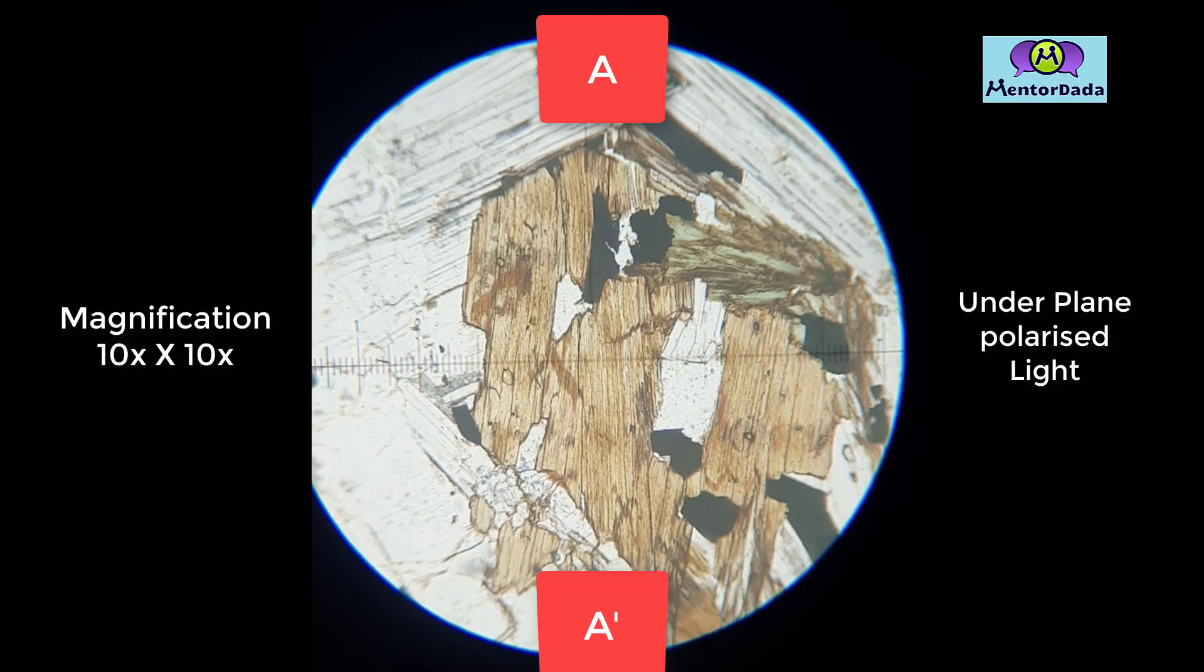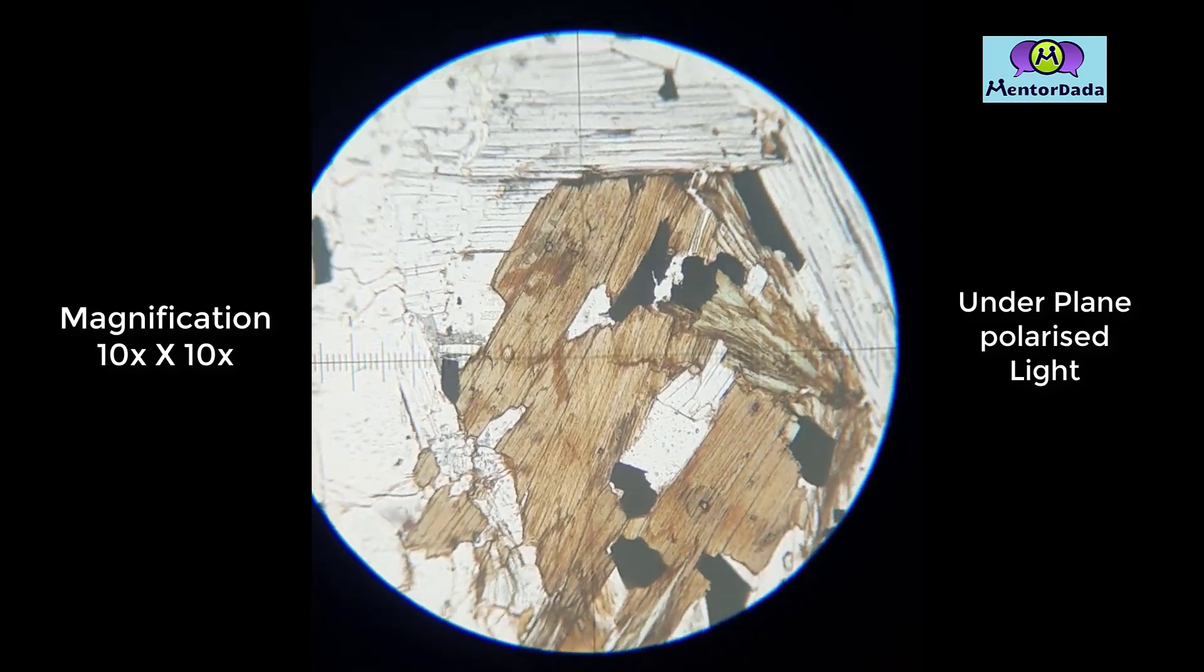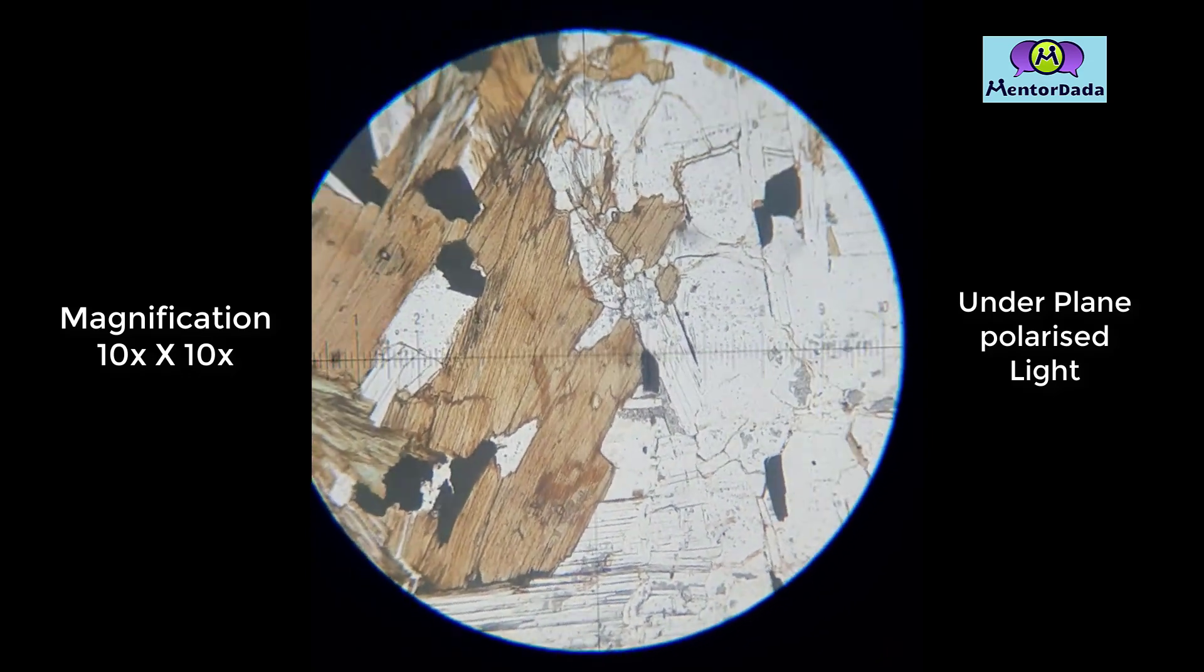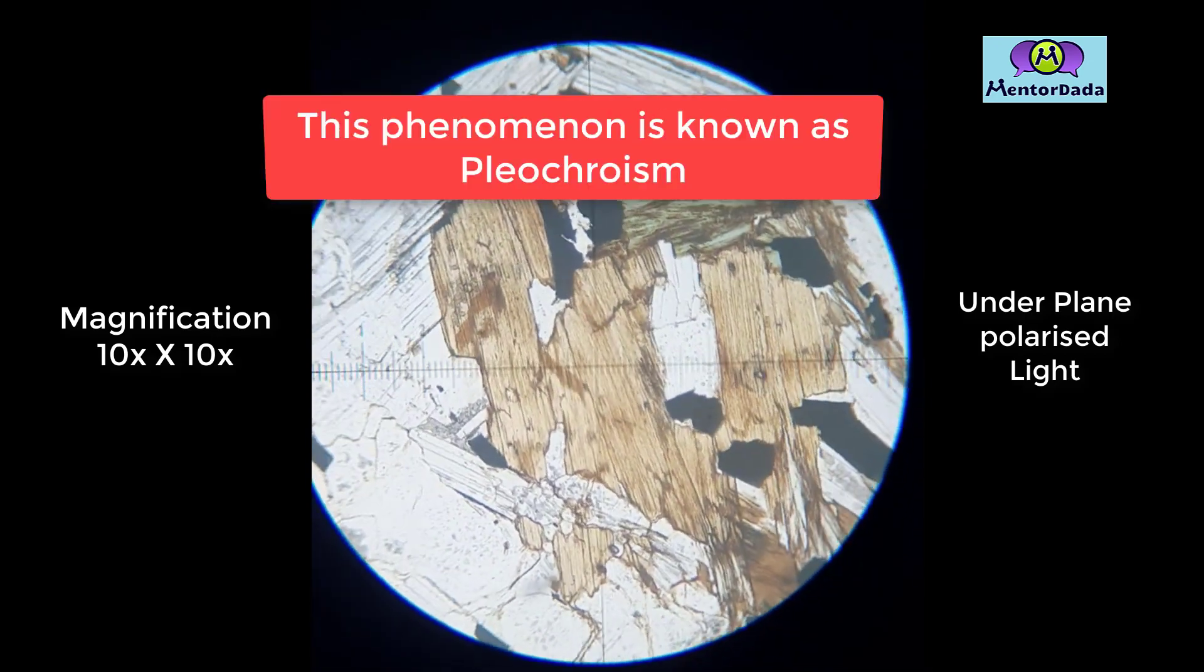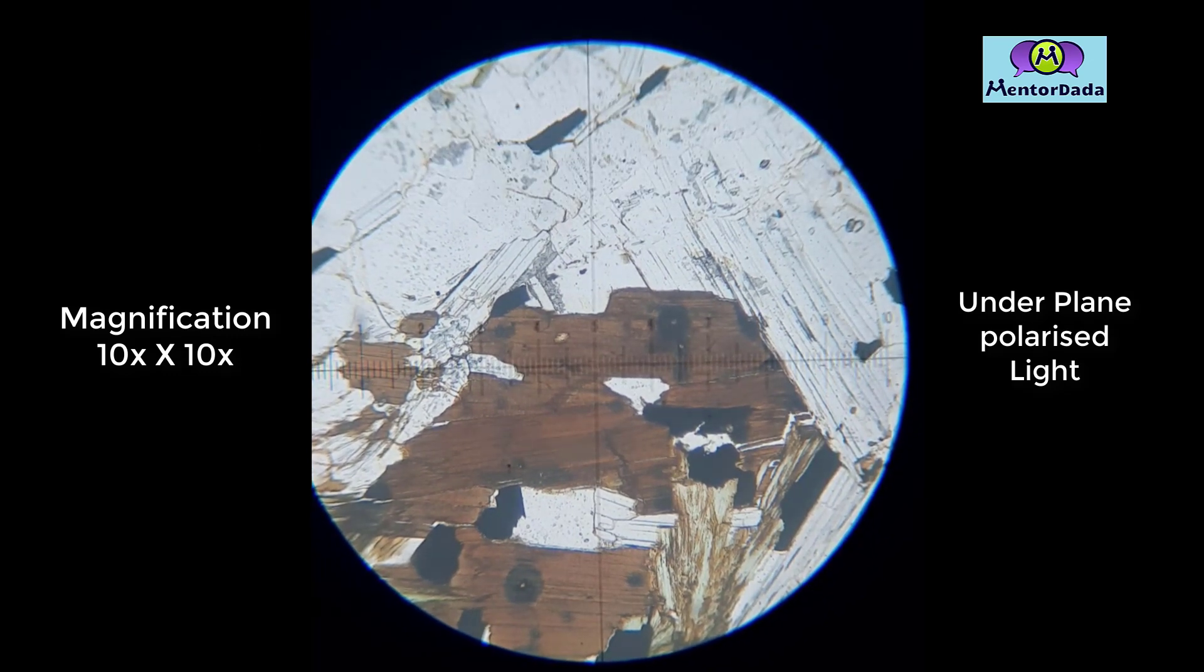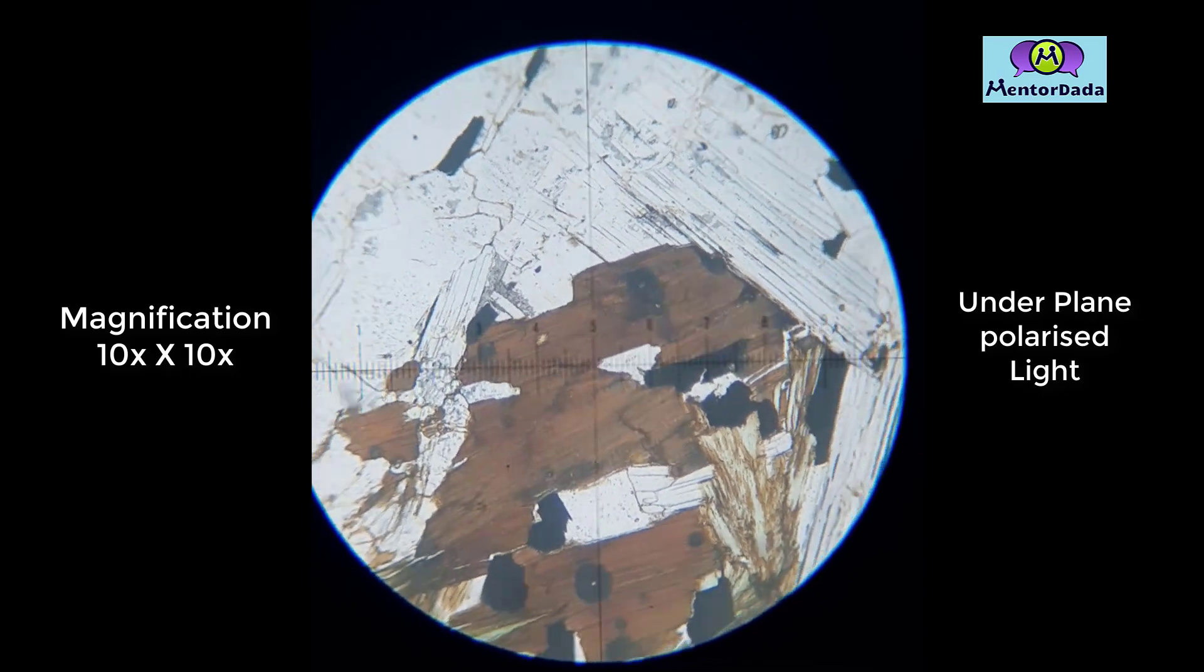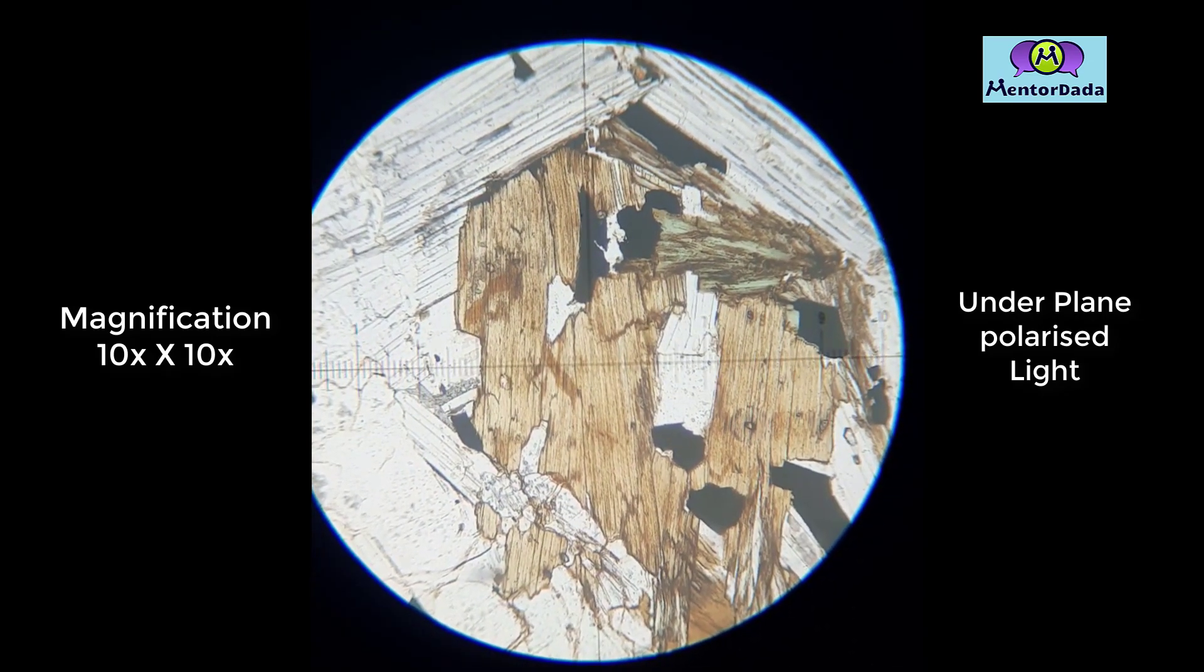Let's observe the mineral and its optical properties. While we rotate this stage, we can observe a certain change in color under plane polarized light from light yellow to dark brown. The dark brown is typically observed along p p dash, while light yellow color is observed along the analyzer direction, that is a a dash.